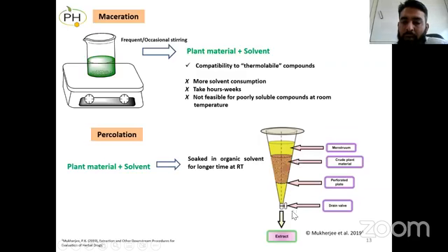You have to take the filtrate in a vessel, and this also takes a lot of time to complete the extraction. When your solvent is mixed with this plant material, you have to give time for it to reach the plant material, allowing the plant material to soak in this particular solvent for some time, and whatever filtrate is coming out, you have to collect it in a vessel.